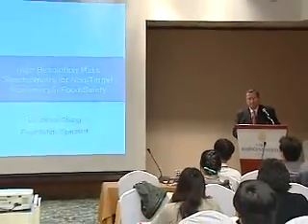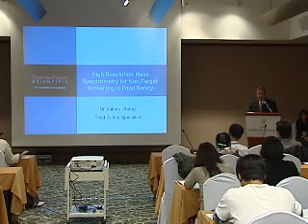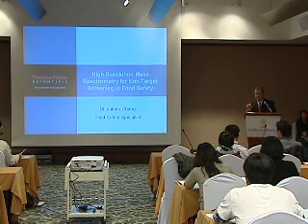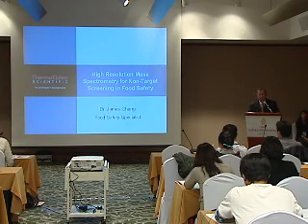Now, to accomplish that, I'm going to talk about what some people call high-resolution mass spectrometry. I prefer to call it high mass accuracy mass spectrometry because that's exactly what we're trying to get to, very high mass accuracy. If you had the molecular weight of any compound to 6 decimal places, I can assure you that you know exactly what that compound is. There is no ambiguity about these compounds. So that's where we're trying to get to.